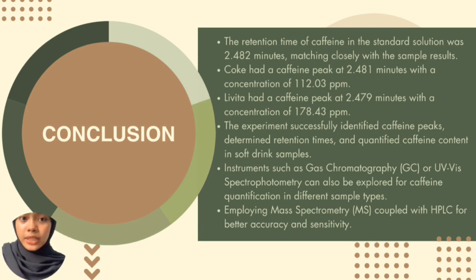Other instruments such as gas chromatography or UV spectrophotometry could also be utilized for caffeine analysis. Additionally, coupling HPLC with mass spectrometry can provide even greater accuracy and sensitivity for future studies.